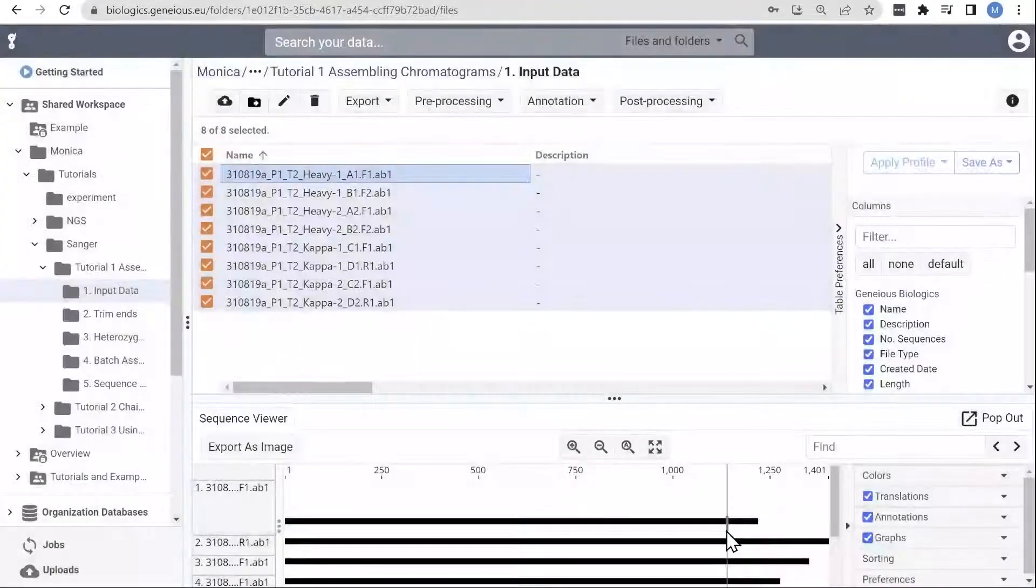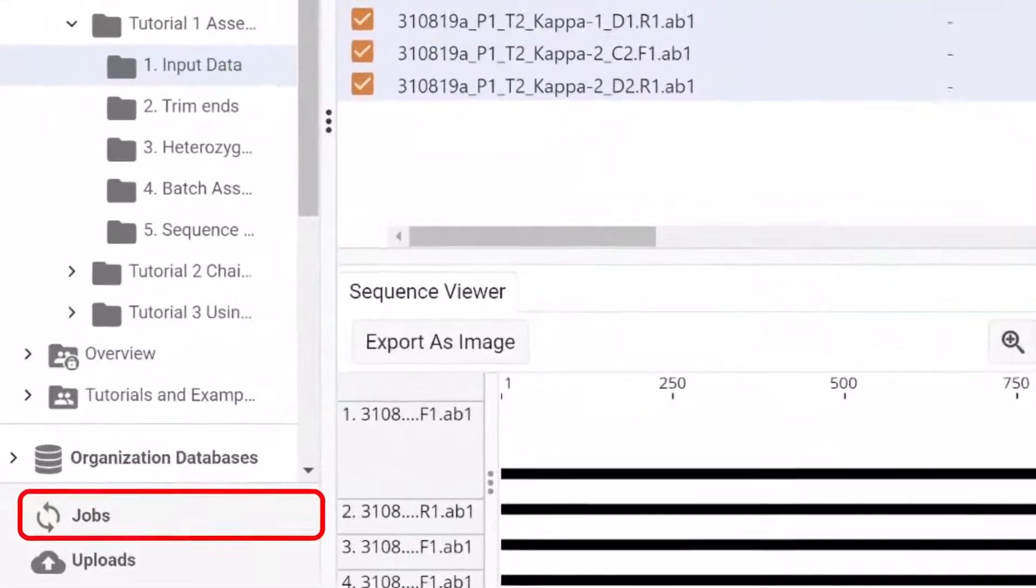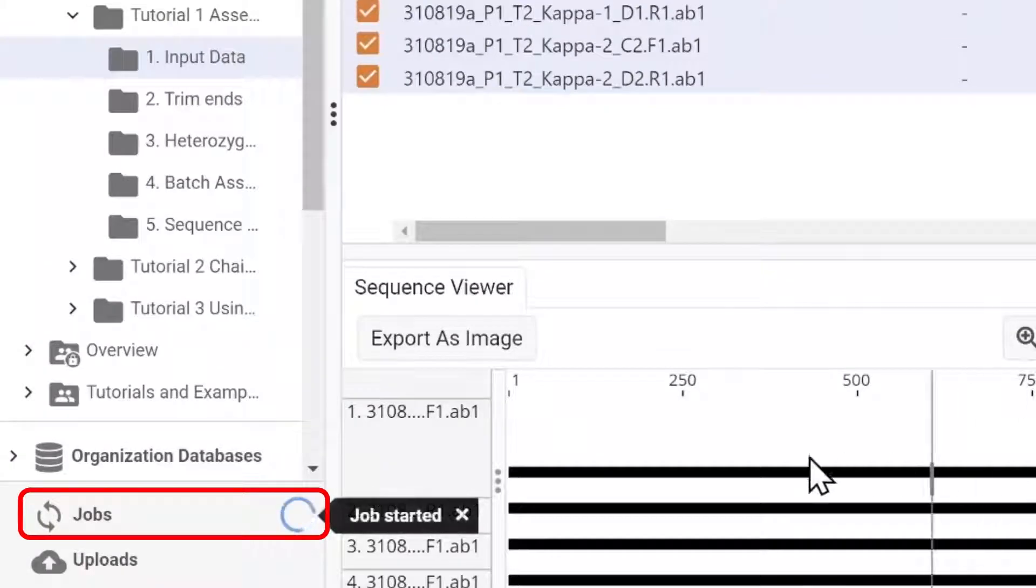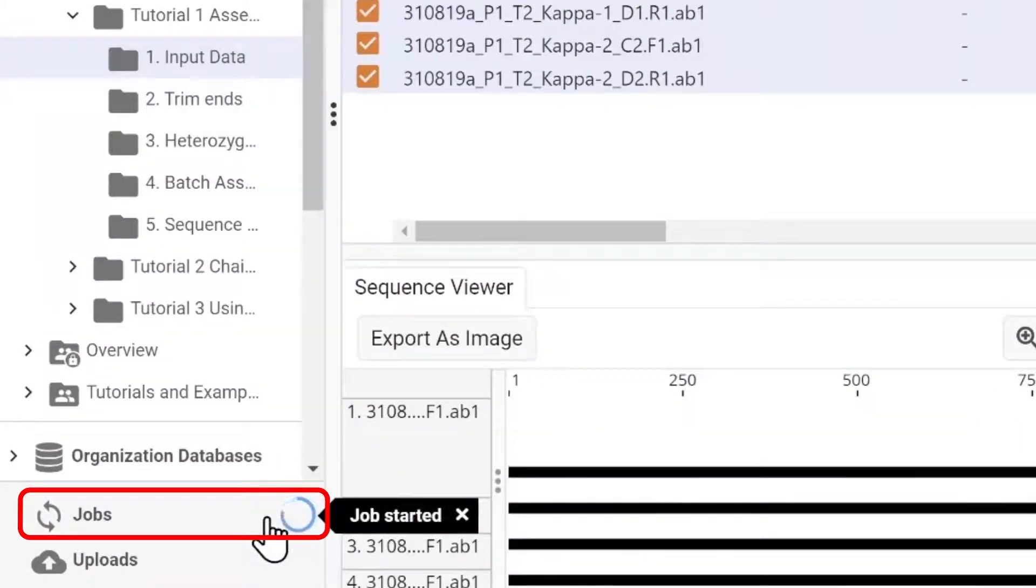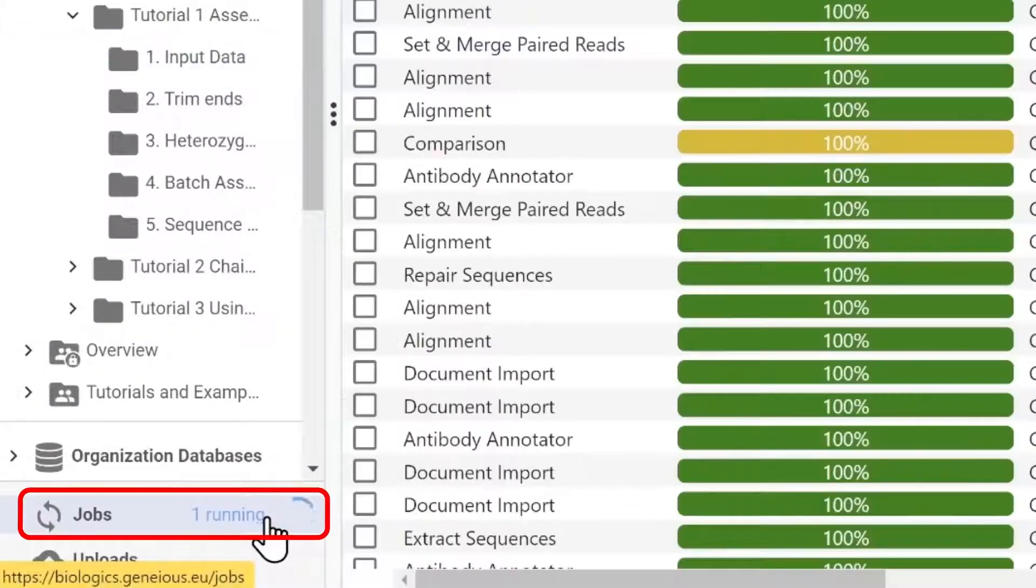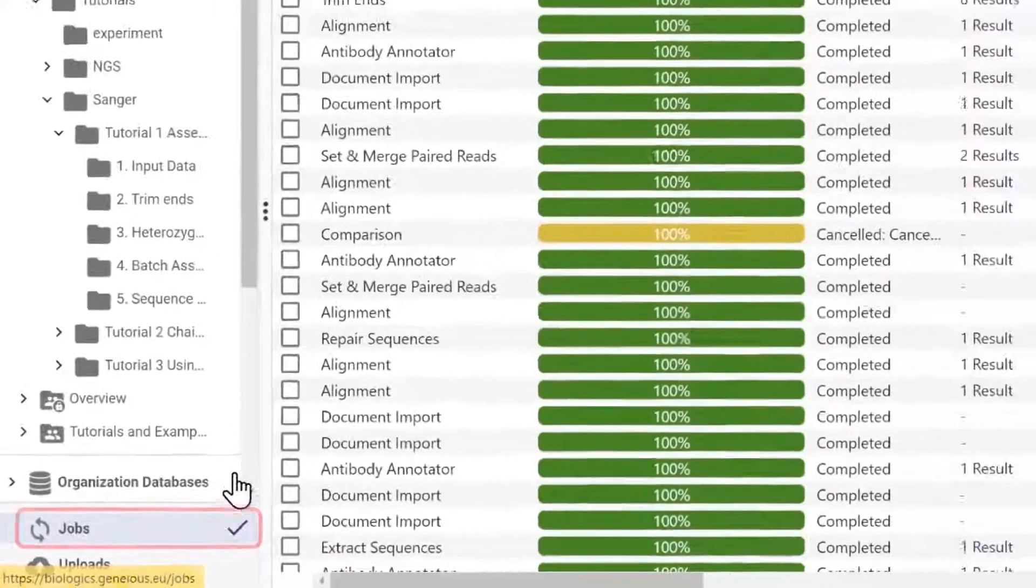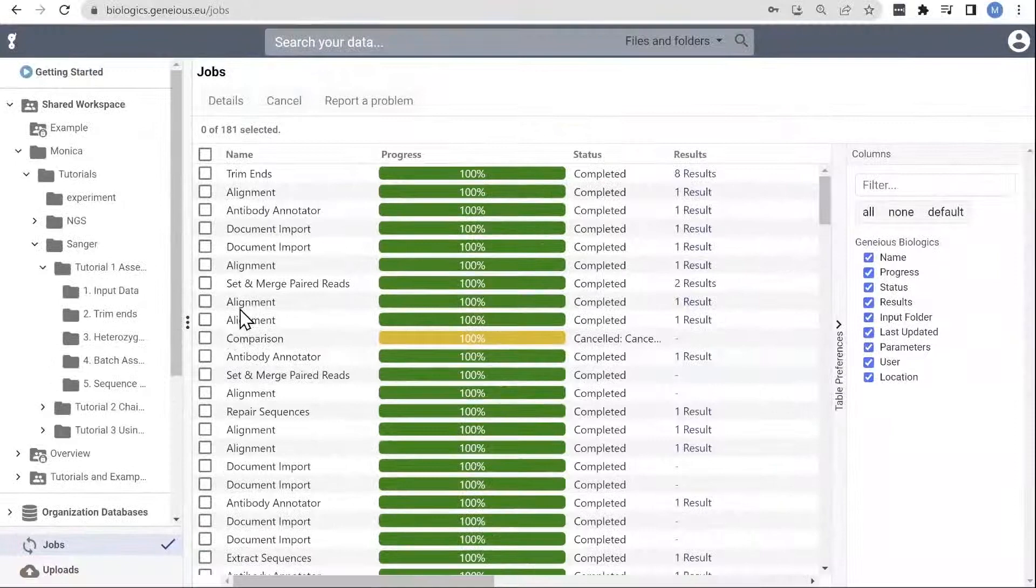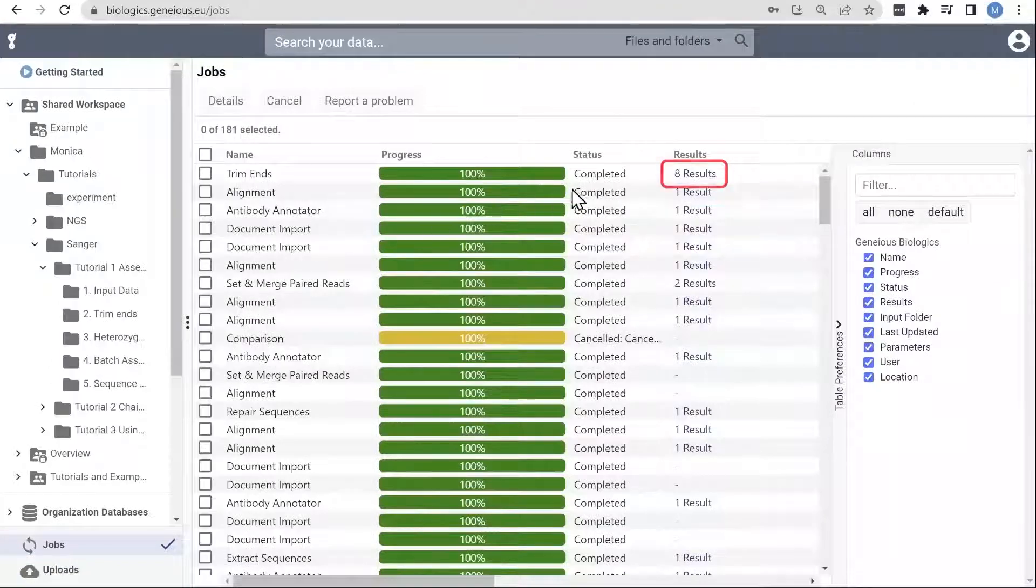When you run a job, it will appear here in the Jobs tab, with activity indicated by the spinning wheel. Once a job is completed, you can navigate directly to the results by clicking here.